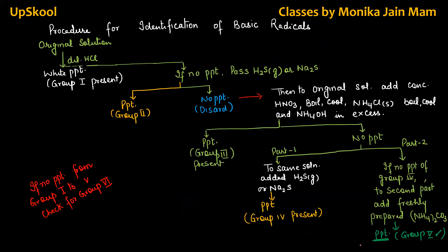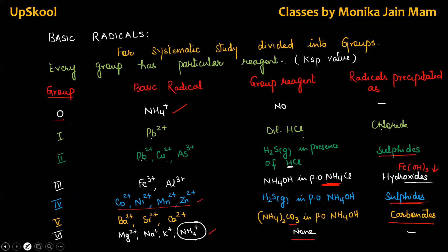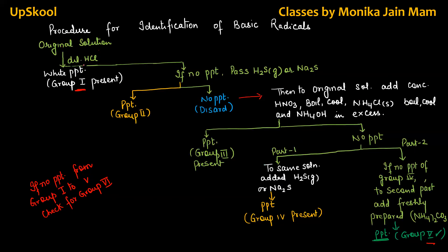Now, this is a flow chart. It's very, very important. If we remember this flow chart, we won't have any problem performing salt analysis in the lab. In this, step by step, all the steps are indicated right from beginning, from group 1 to group 5. First we make original solution. Dissolve salt in water. As I have written group reagents here, same way, dilute HCl. If you get precipitate, group 1 present. Then you will stop. Wherever your identification happens, there we have to confirm. But, if you will not get any precipitate, then pass H2S gas. It means this is step 1. This is your step 1. And here this is step 2. No precipitate, pass H2S gas. And H2S gas smell is very pungent. So nowadays in labs, H2S gas is replaced by sodium sulfide. It also gives sulfide ion.